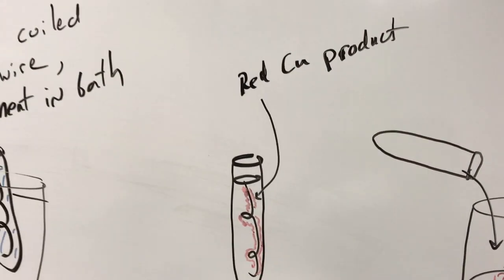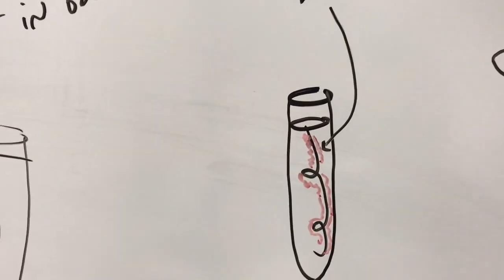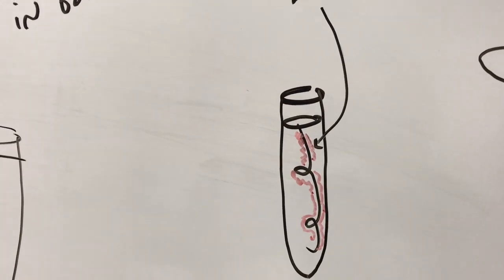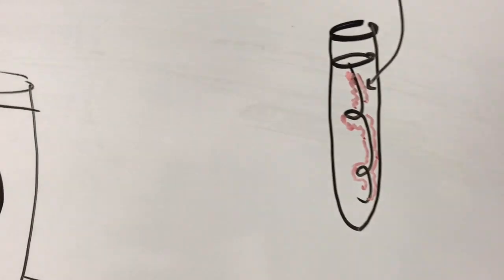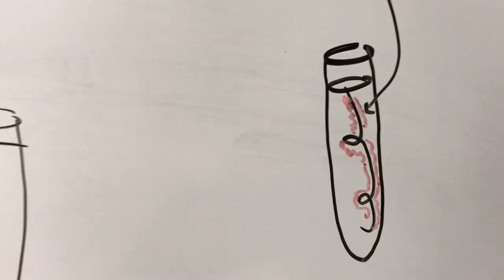When the reaction is done, we're going to see a red solid that has formed all over the aluminum coil. It's going to look kind of like a fuzzy red worm. Note that your solution at the beginning was blue, and here it's going to be clear. We'll know the reaction is done when the solution is completely clear.